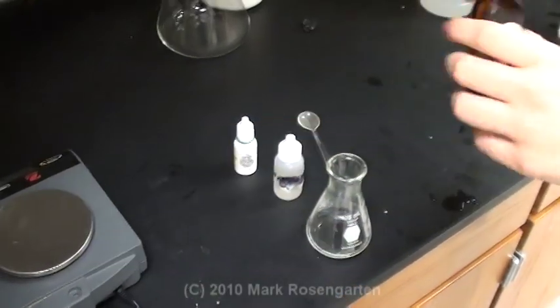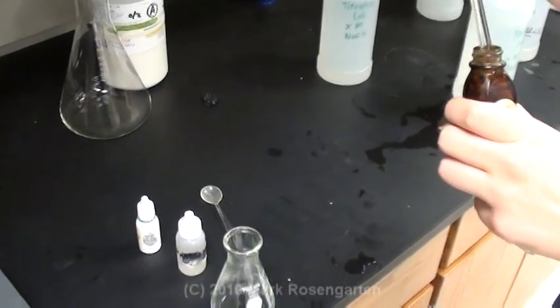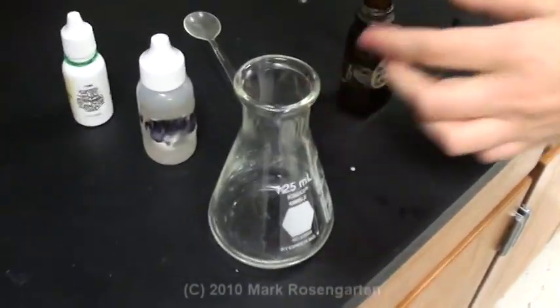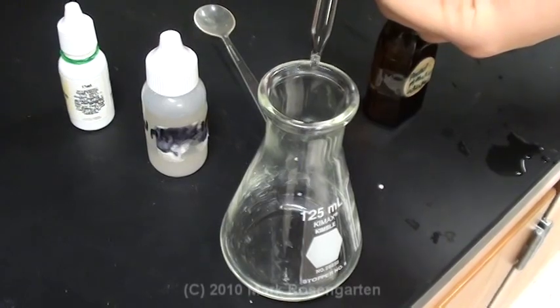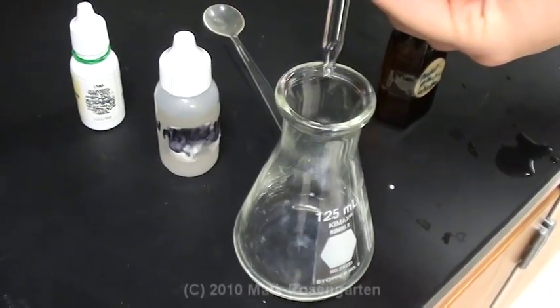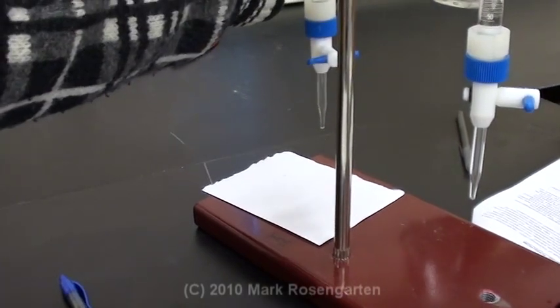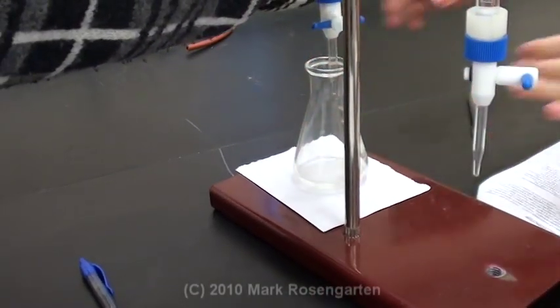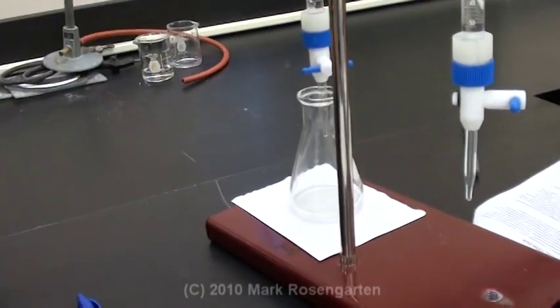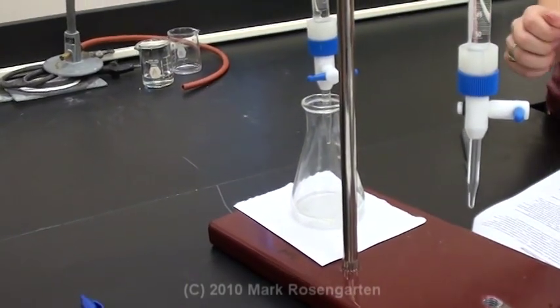And now add three drops of phenolphthalein to your acid. Place a white piece of paper underneath the base burette. Place the acid flask underneath and start adding your base.